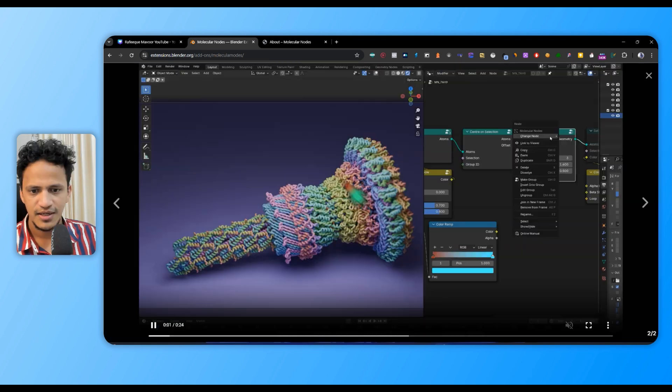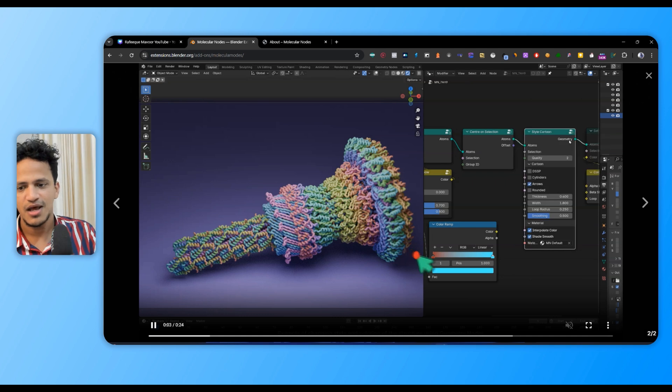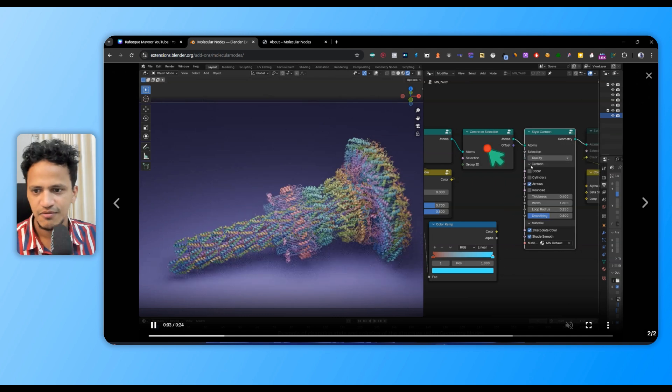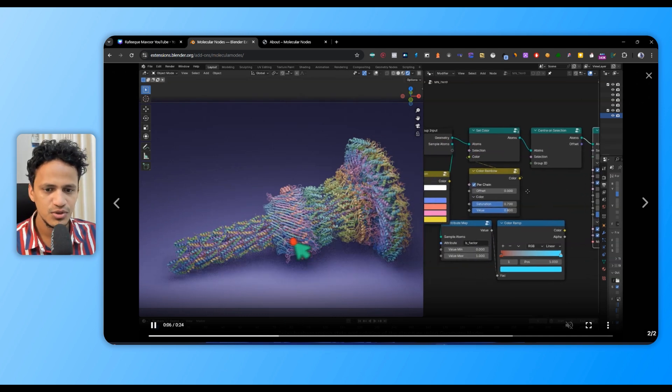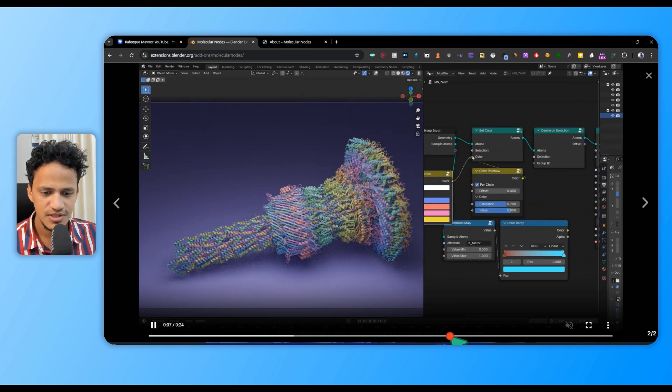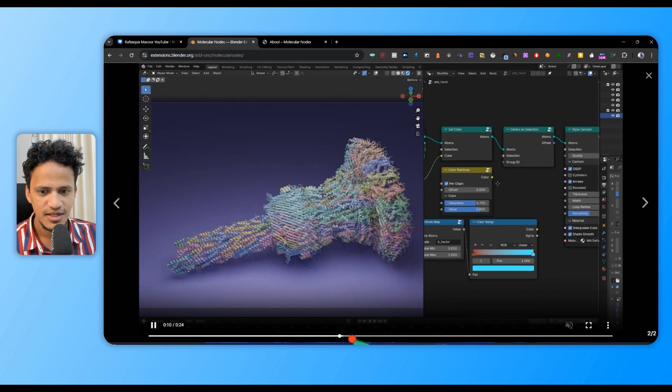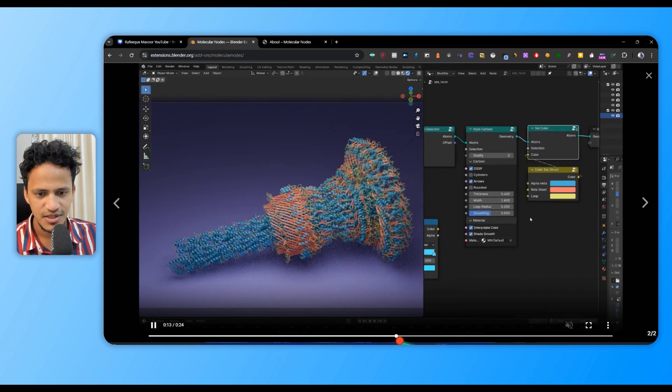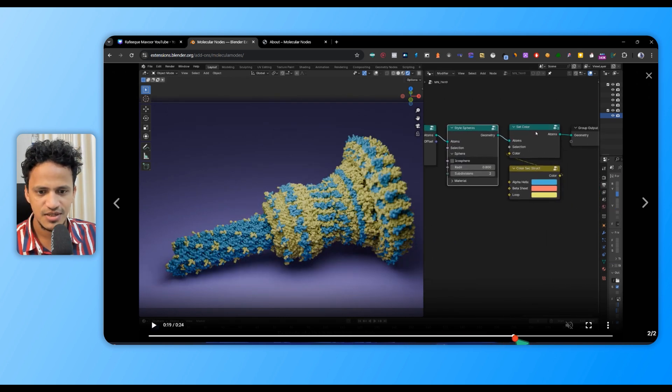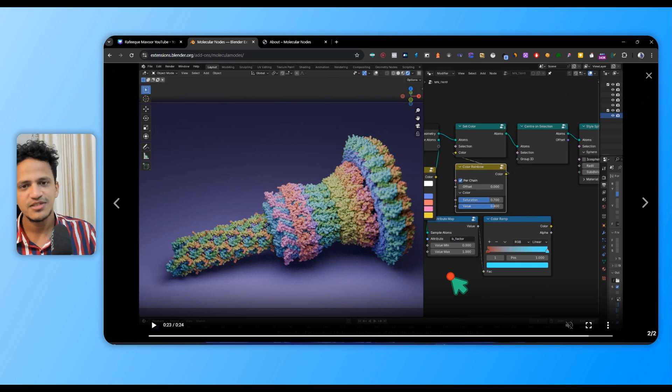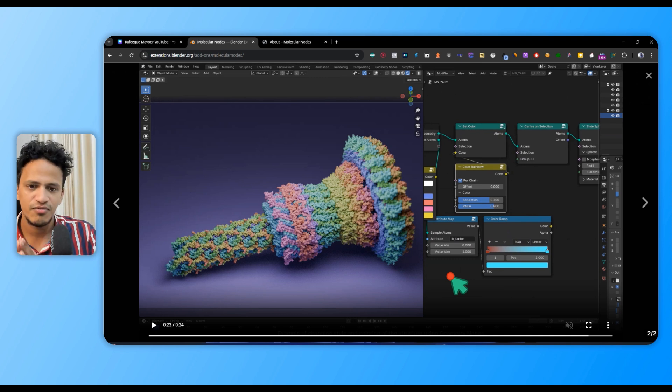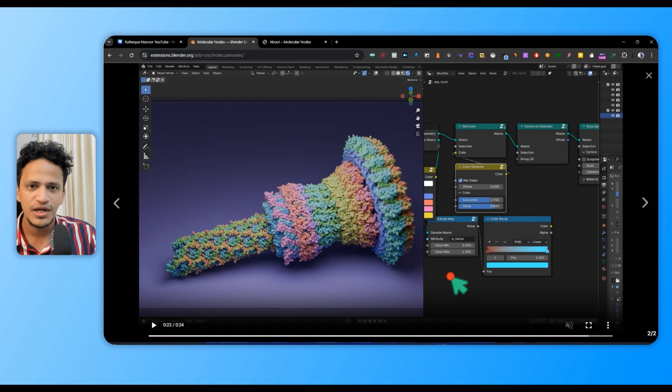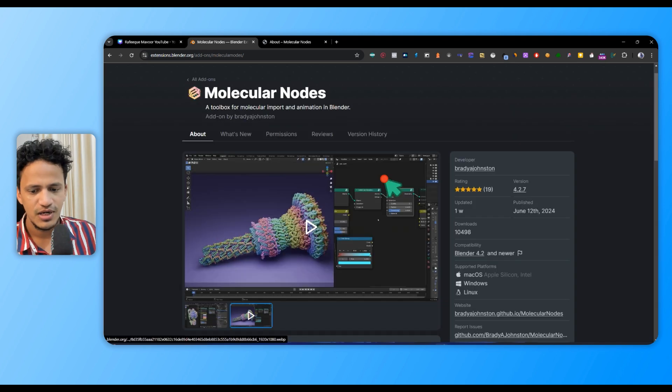Here you can see an example - we have a protein structure. Here's a visualization of a flagellar motor where different nodes are used to change the visualization style: ribbon structure, spherical structure, and so on, which means you can customize protein visualization in all details.